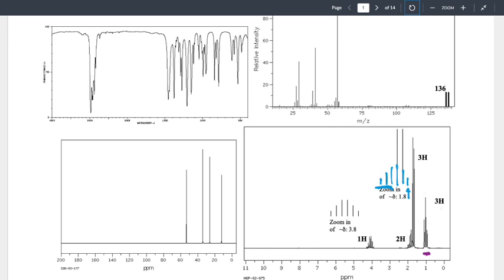Am I on the screen? I got that. How many carbons? 4. How many hydrogens? 9. But this is a problem. I'm missing something. Where's that bromine? Oh, that's right. Back in my chemical formula, I had a bromine. Bromine has only one bond left. So now I could say my final structure is that carbon chain with a bromine in the middle of it. And I now have a final answer where all the pieces internally corroborate each other.